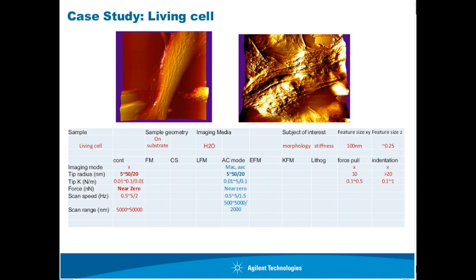If there are silicon boundaries and then grains, the boundary and grain might have different electrical properties, capacitance, and so on and so forth. Therefore, maybe you should think about an imaging mode that can differentiate these differences in physical properties, instead of only relying on the roughness itself, because roughness does not tell the difference.